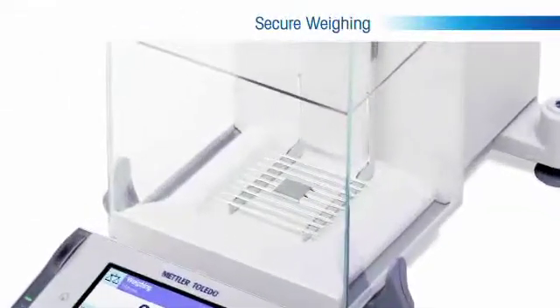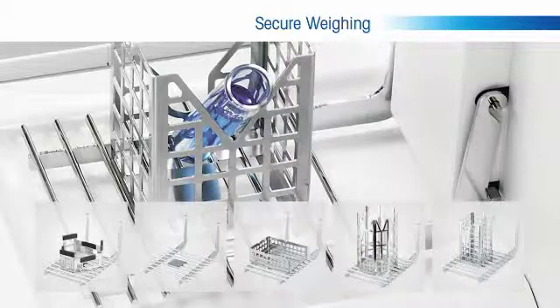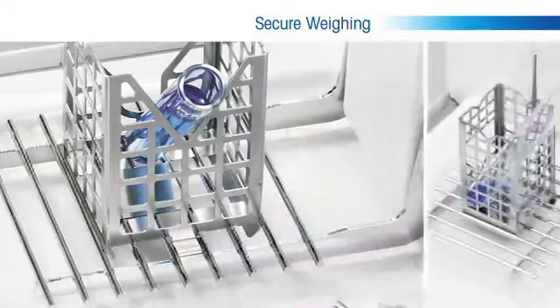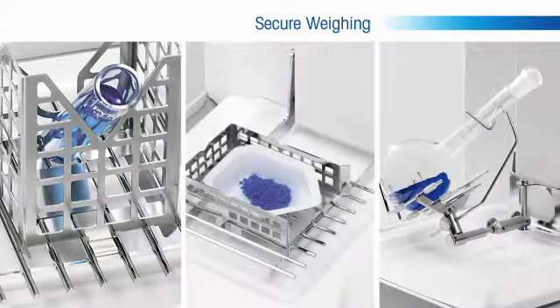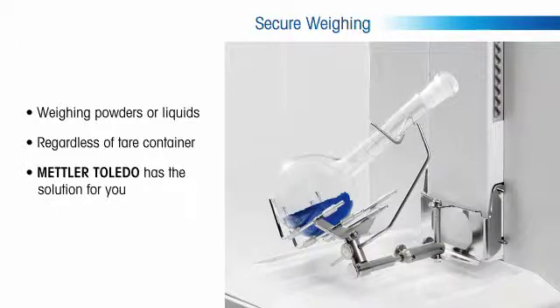Nearly all samples must be weighed with some type of tear container, and it is often a challenge to find the proper one for your sample that also works cohesively with the balance. Mettler Toledo has addressed this concern with their patented ErgoClip offering. These unique products allow for one easy step dosing directly into your tear container. The two varieties of ErgoClip either snap onto the existing smart grid or replace it with the same cantilever technology, ensuring you are weighing samples securely and conveniently each and every time.